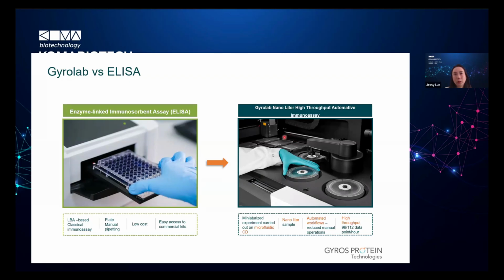So what you need to do is just place the samples in this 96 plate, similar to what you do before, and also place the reagent into another plate. After that, everything will be done automatically. The samples and the reagents will be added into this plate automatically by needle, and the speed is quite fast.